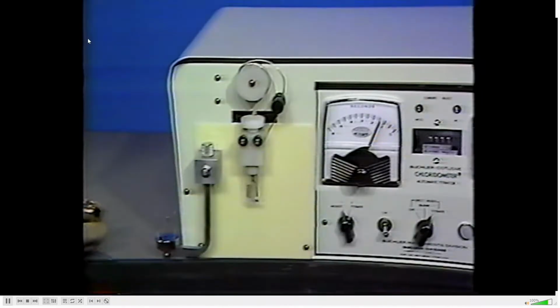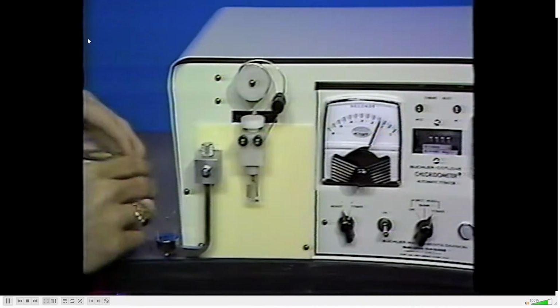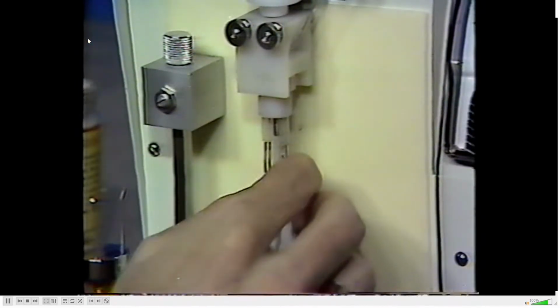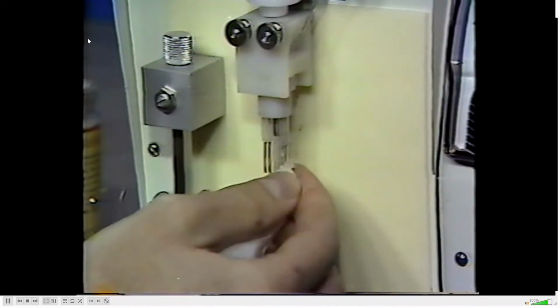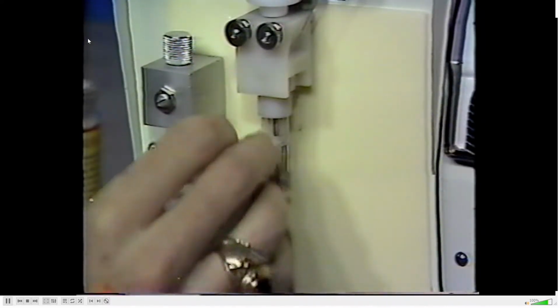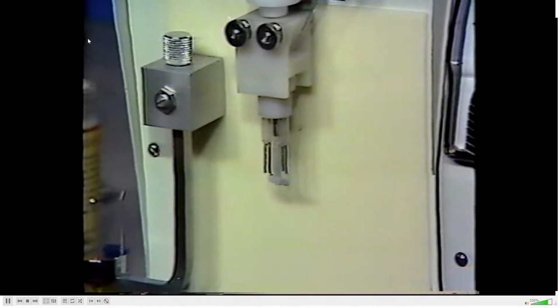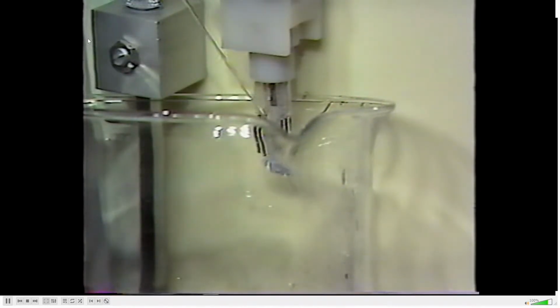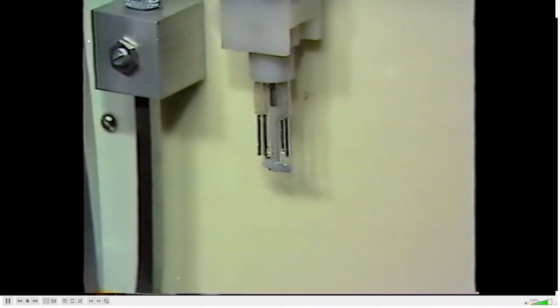It is necessary to clean all surfaces of the electrodes with a water-soluble silver polish. Pay particular attention to cleaning the feet of the electrodes. Gently scrub tarnish and residue from them, and follow the cleaning operation with a deionized water rinse. Water droplets left from this rinse do not affect the titration, so do not attempt to dry electrode surfaces, since you will inevitably contaminate the surfaces with chloride.